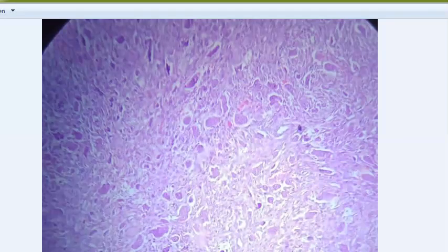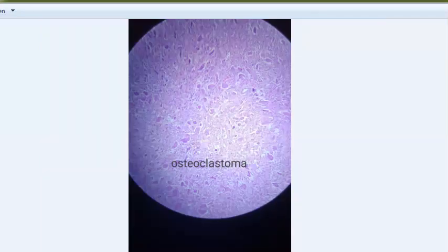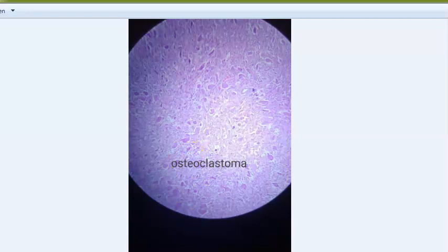You can see giant cells and stromal giant cells here - this is osteoclastoma, a giant cell tumor, which is a benign condition of the bone. Osteoclastic giant cells are present, but these are not the tumor cells - they only resemble osteoclasts. The actual tumor cells are the stromal cells. Osteoclastoma is found in the epiphysis of long bones, commonly at the knee joint - the lower end of femur and upper end of tibia. The giant cells can have around 100 nuclei but are non-neoplastic.